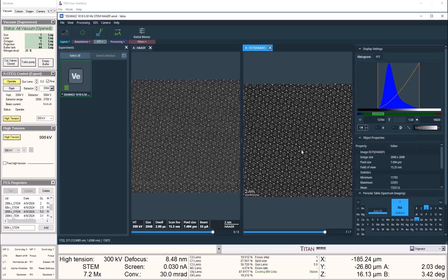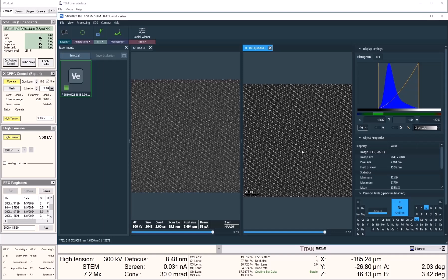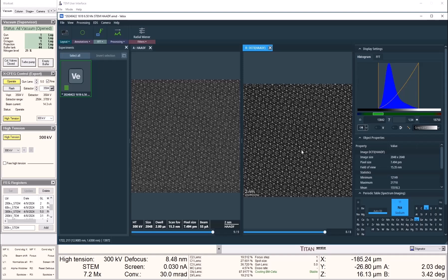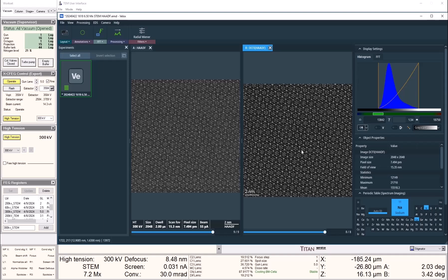And now we have a high-quality atomic-resolving STEM image by exercising the automated OptiStamp function.